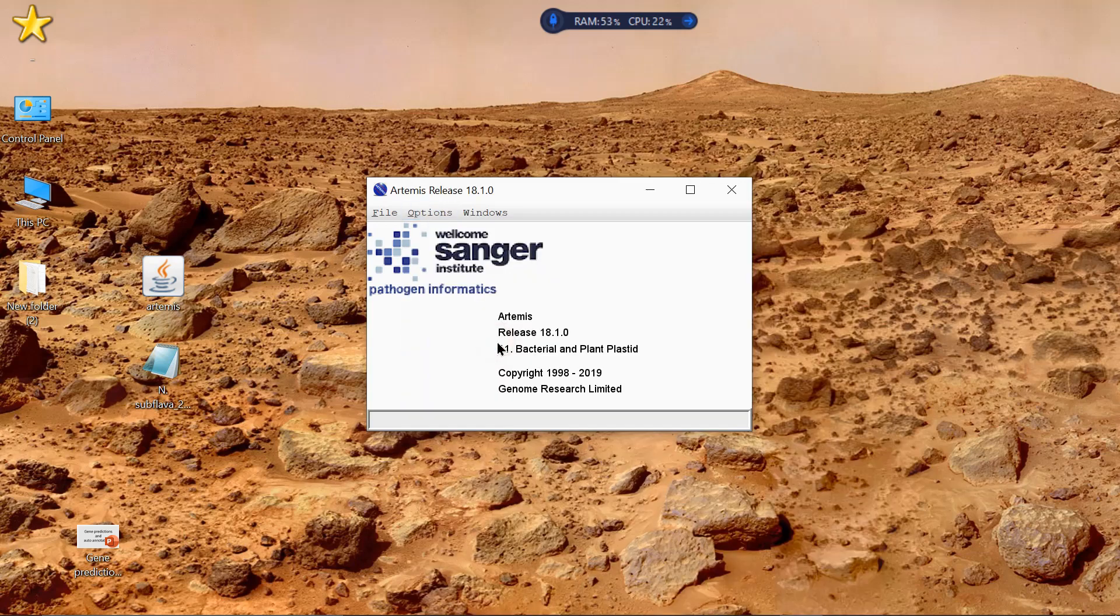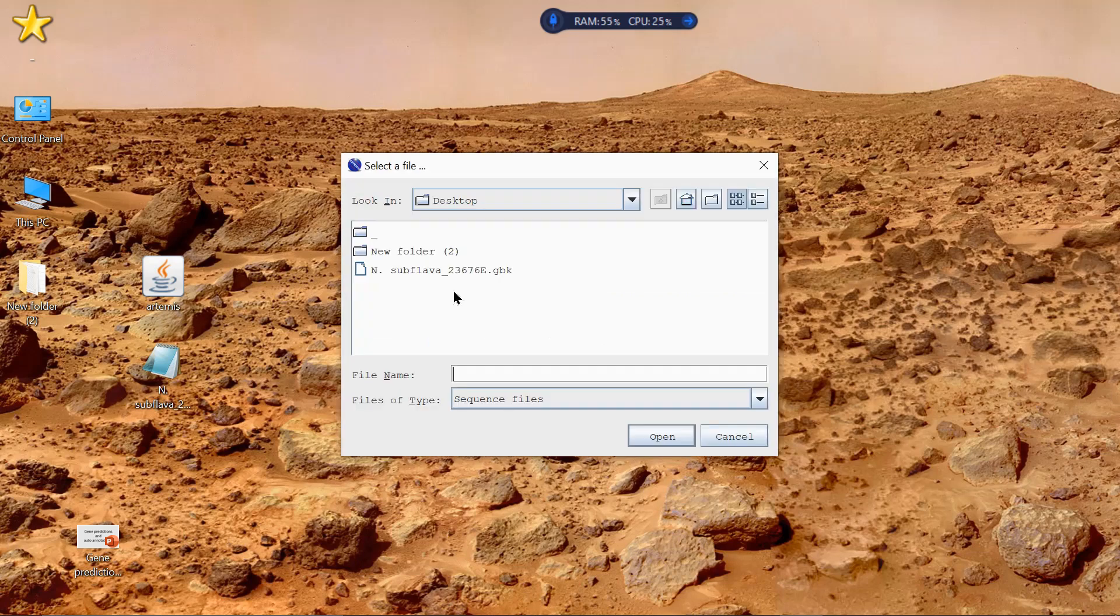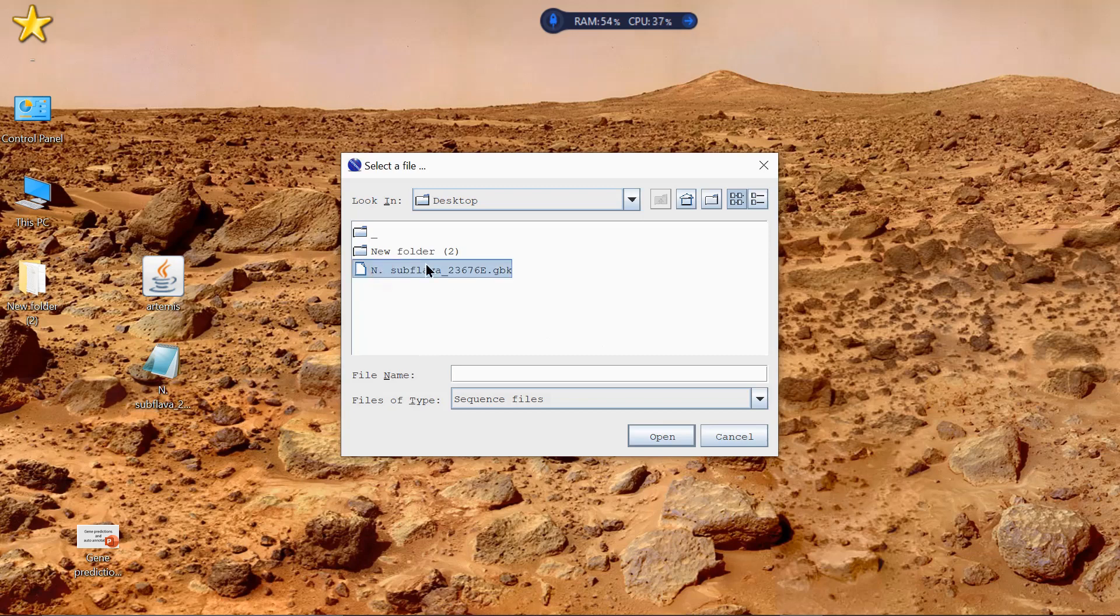Then, you want to import a GenBank file. So if you go File, Open. Now, wherever you saved your GenBank file to, mine's on the desktop. So I'm going to just open that one there.